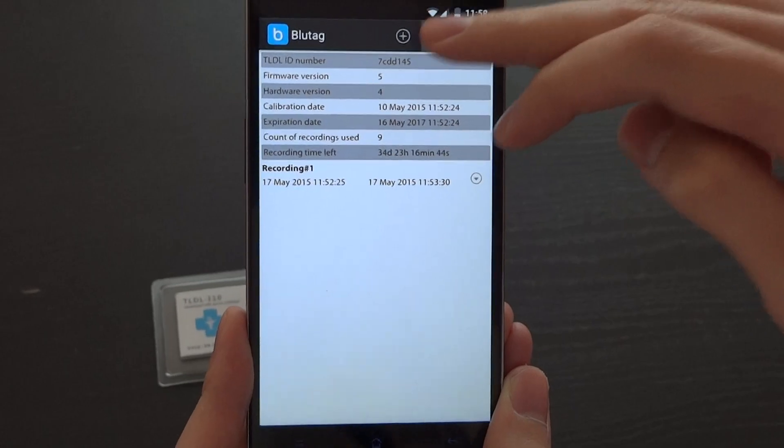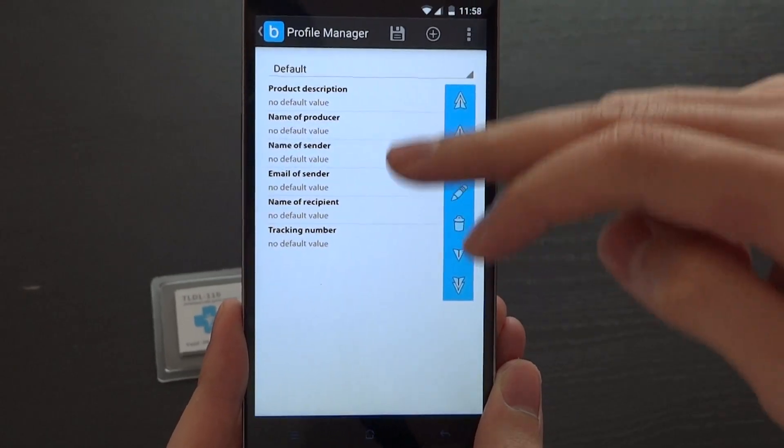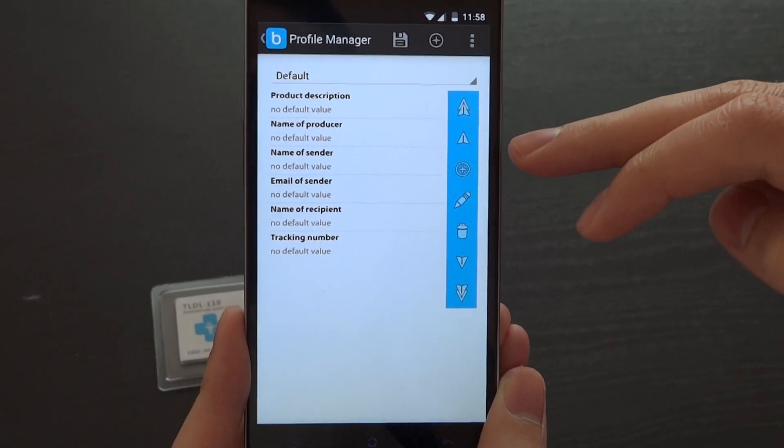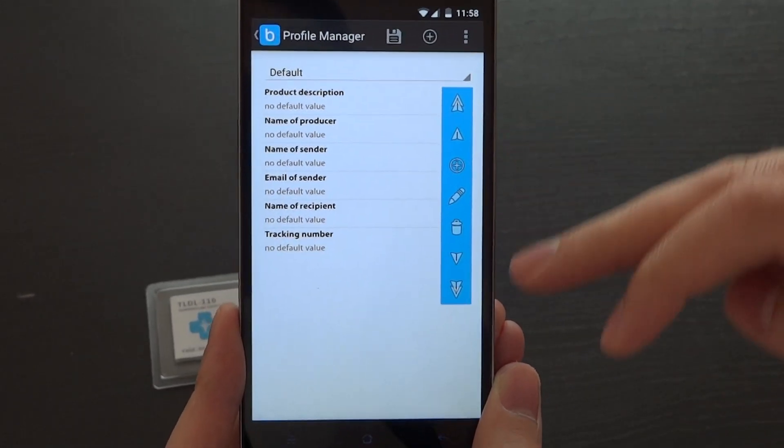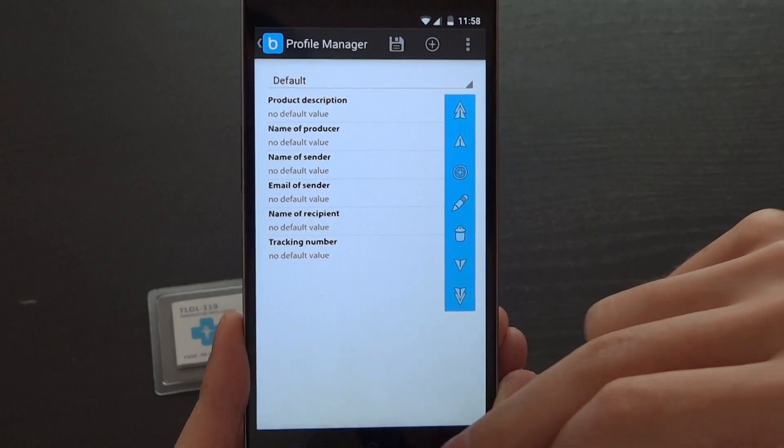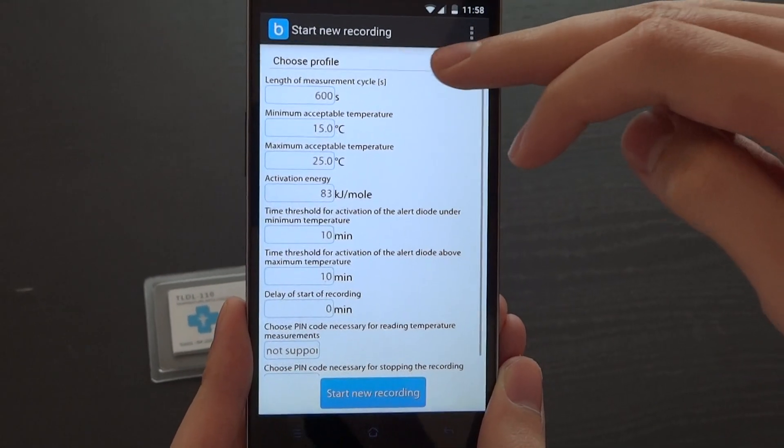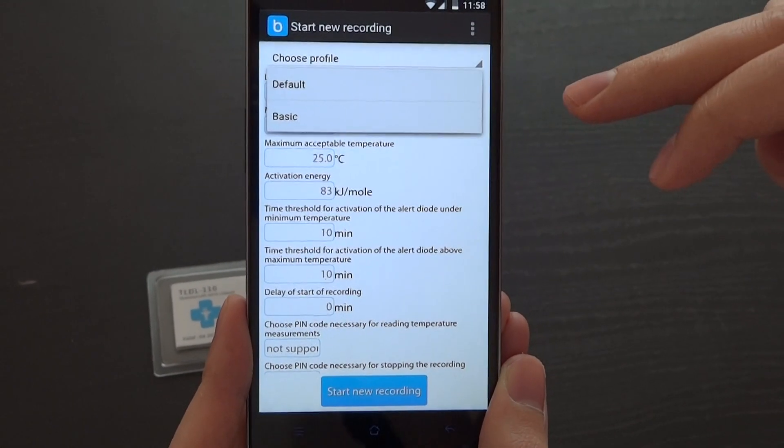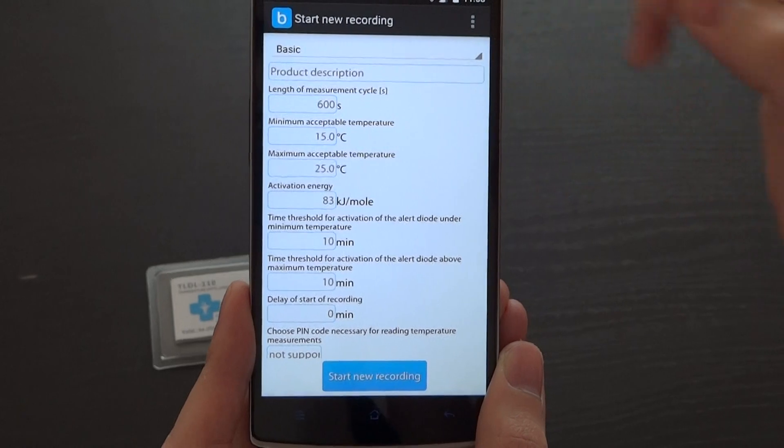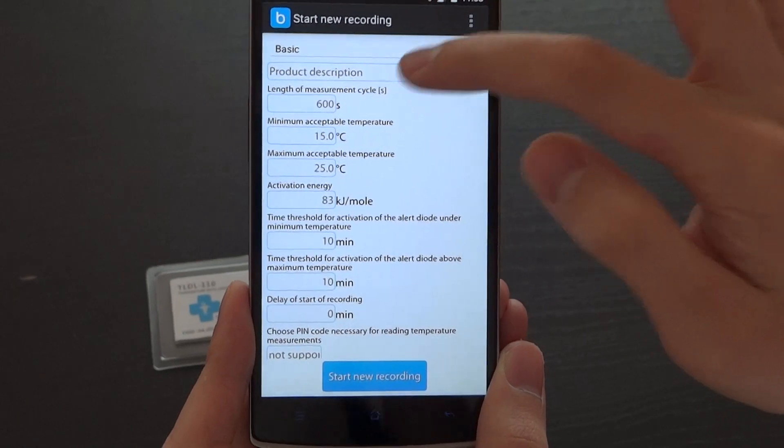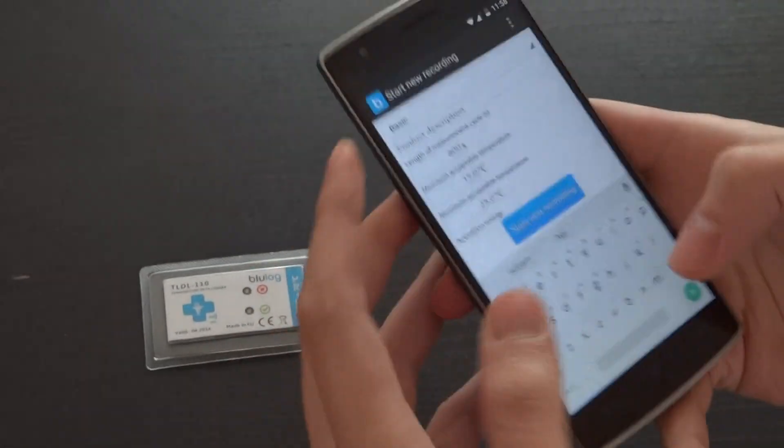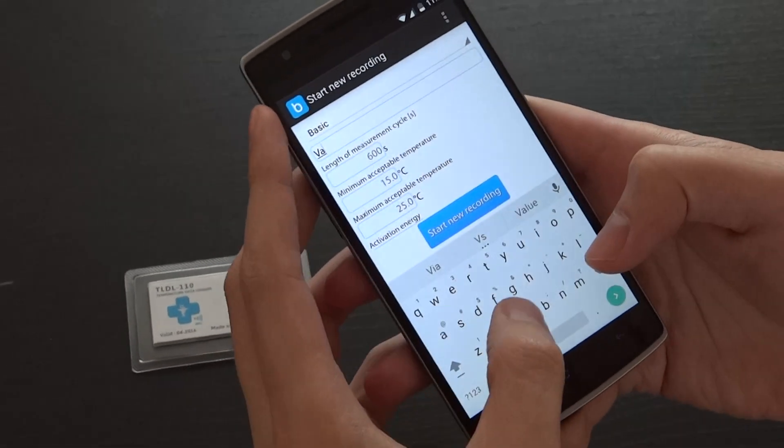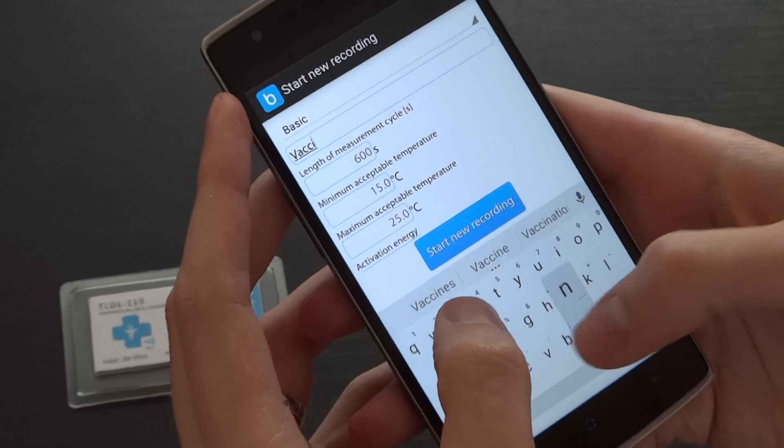These profiles can be customized on the profile manager page where you can create your own fields. Going back to this page, we can choose for instance the basic profile and indicate product description, for instance vaccine.